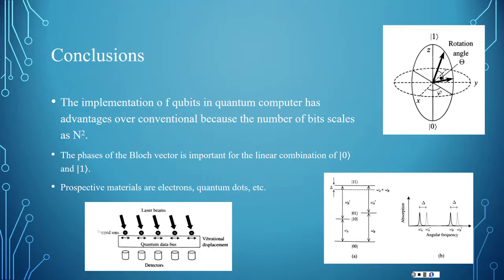Yeah. So the storage time is limited by the time of free induction decay. Everything, processing, reading, storing should be done before it happens. Really quick. Otherwise, it is a benefit if you're doing processes, because you want it to be quick. You don't want to have to wait a long time.